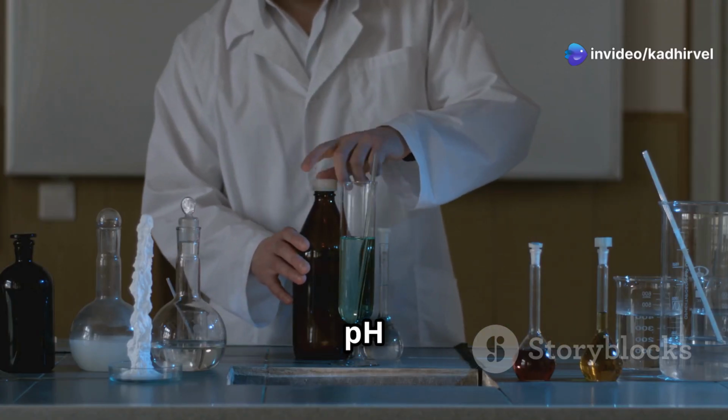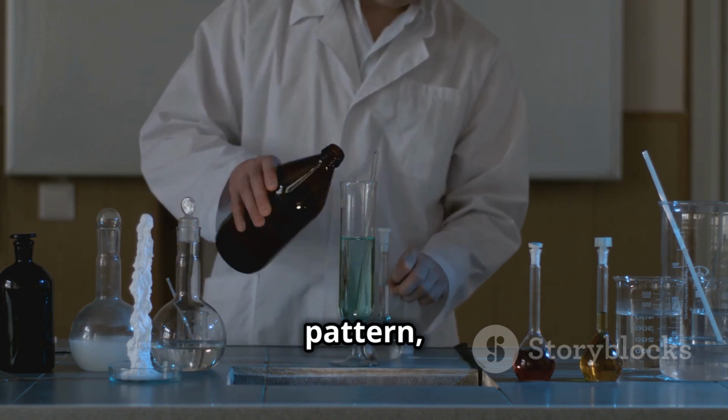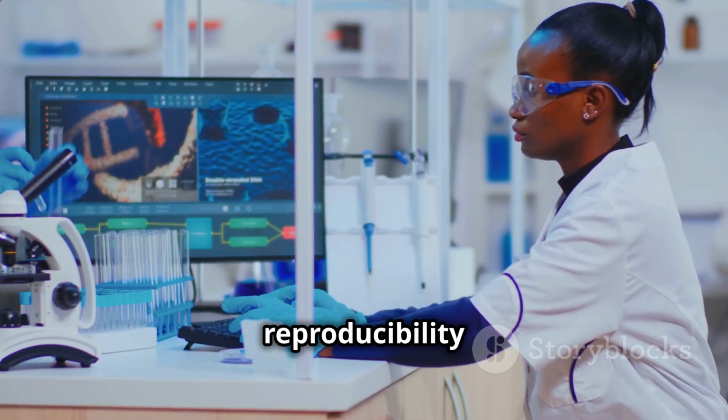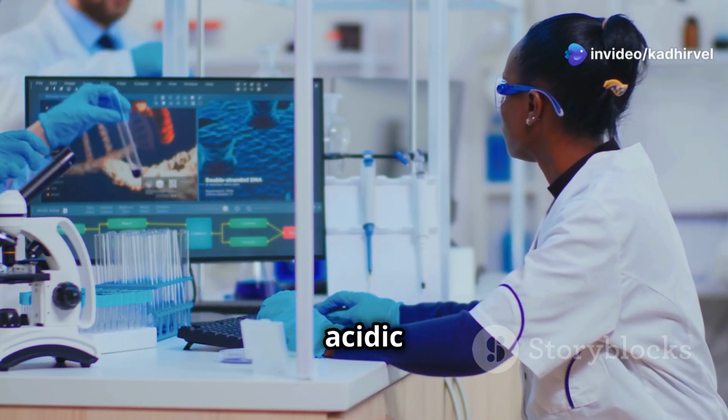Precise control over pH and conductivity is critical to maintain a consistent elution pattern, ensuring reproducibility and purity of the mAb product by efficiently isolating acidic variants.